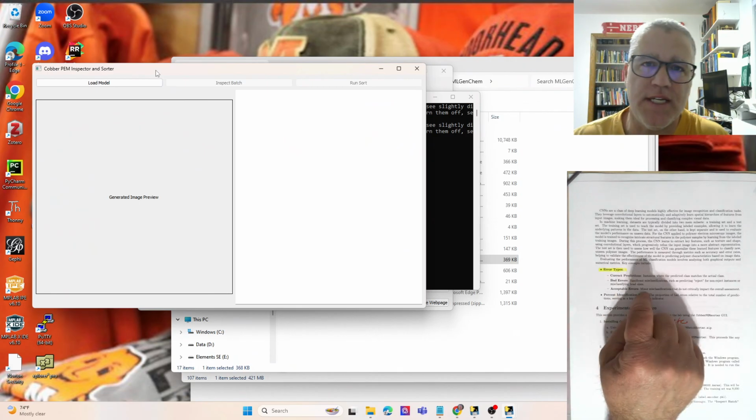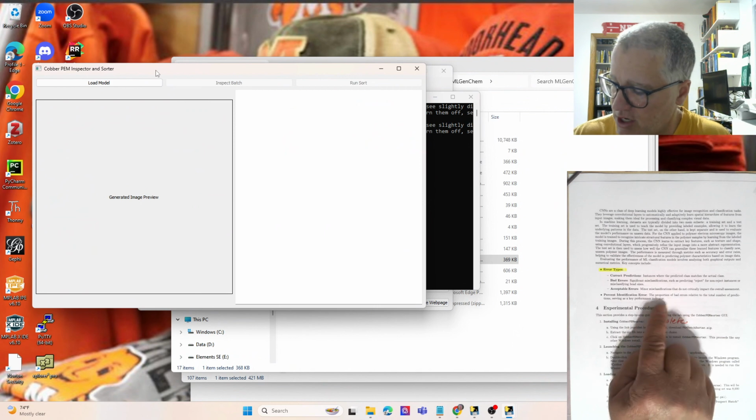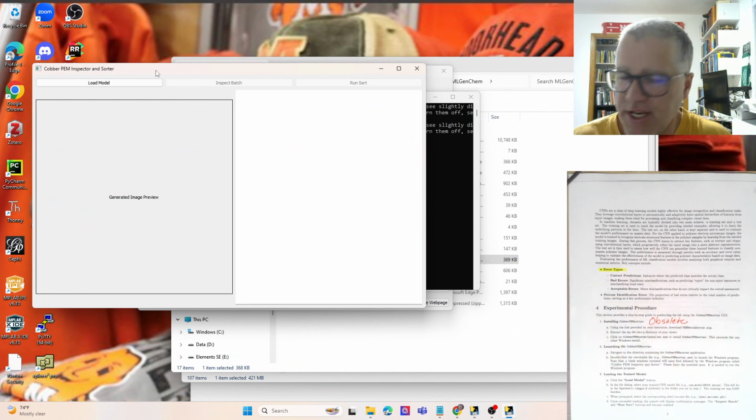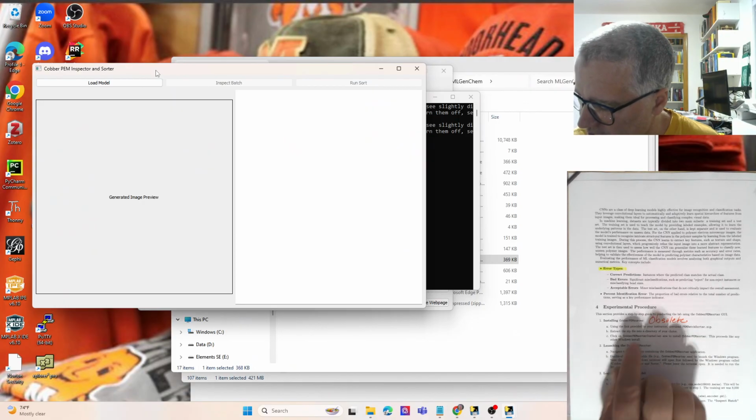Acceptable errors would be if it says it's small, but it's actually acceptable small, or large, acceptable large. And then what we're going to do is run 200 of these images and get a percent error. And I'll probably just run it once. You're going to run it 3 times, take an average to get a sense for what these different levels of training will do. Okay, so let's go ahead and launch this.